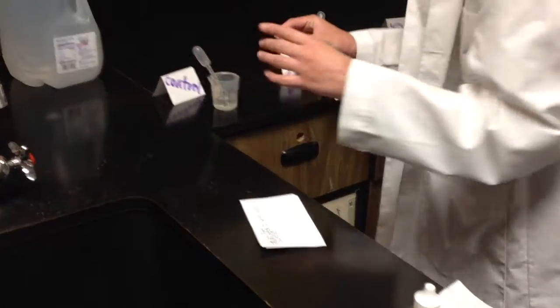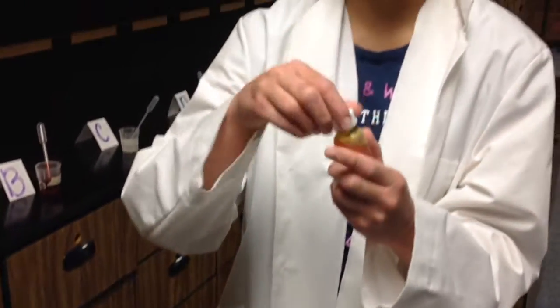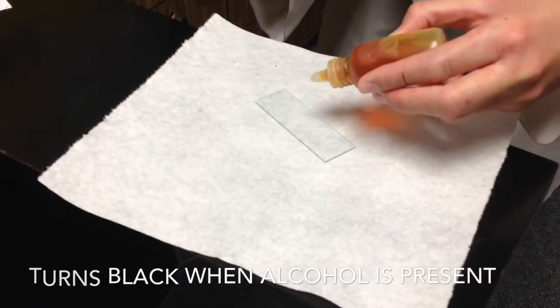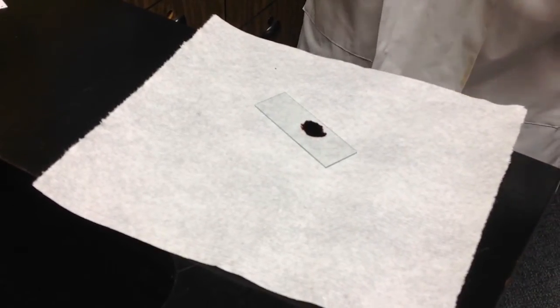After you put one drop on the slide, you add the reagent that tests for the presence of alcohol. If there's alcohol in it, it will turn black. Just put one drop of the reagent in there, and it will turn black because there is alcohol in the control.